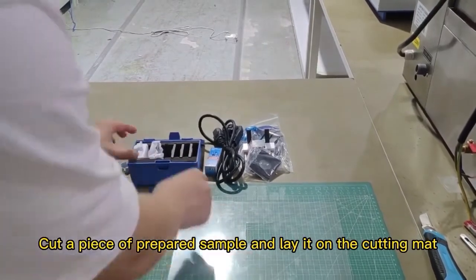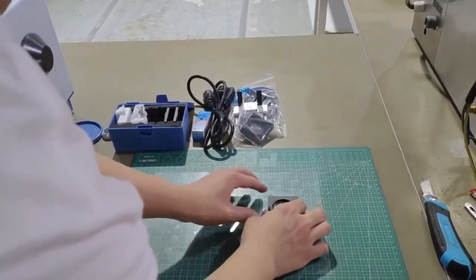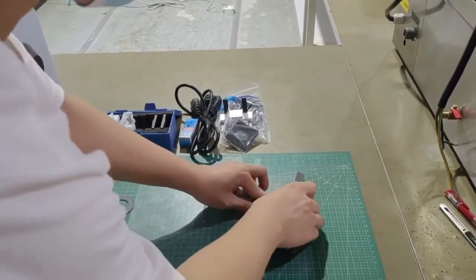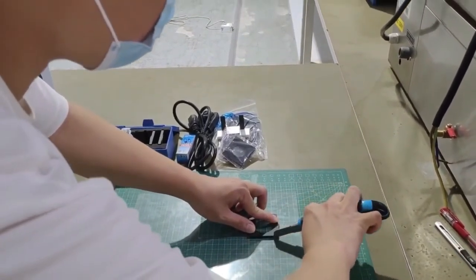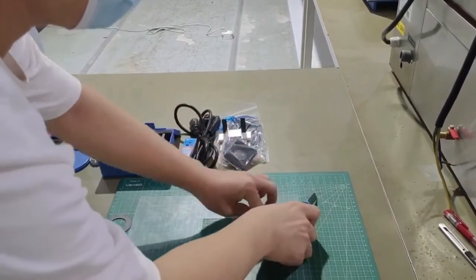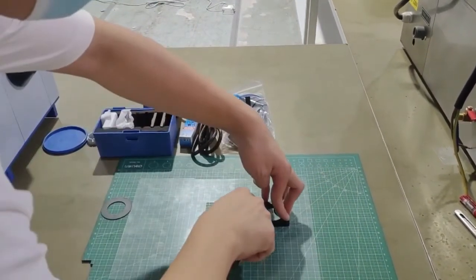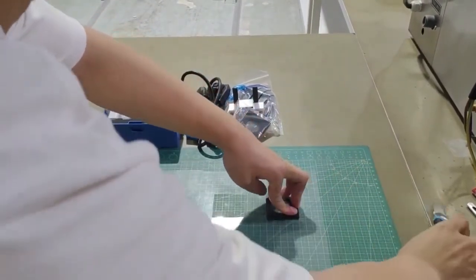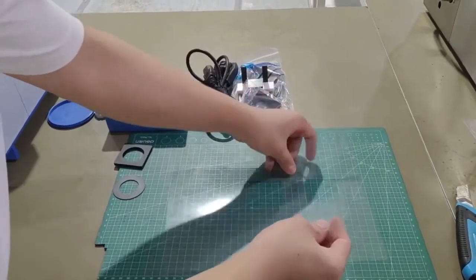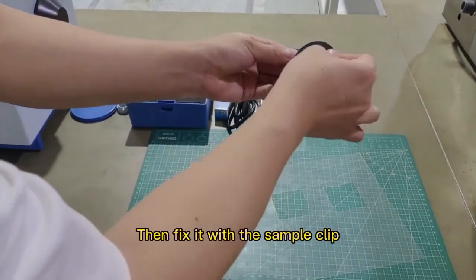Cut a piece of the prepared sample and lay it on the cutting mat. Cut a square the same size as the sample clip. Then fix the cut sample with the sample clip.